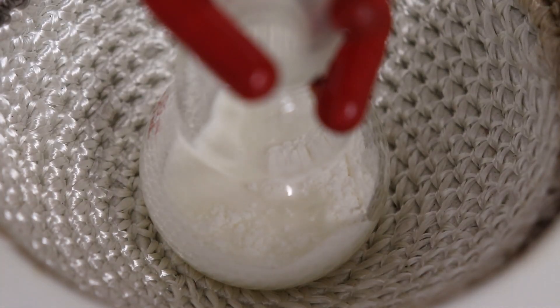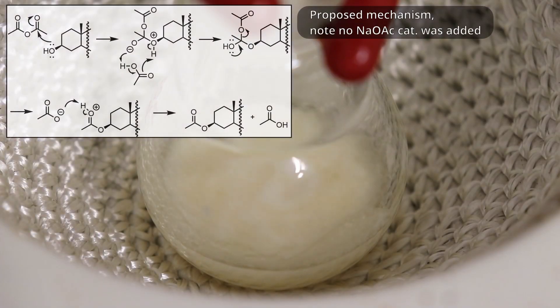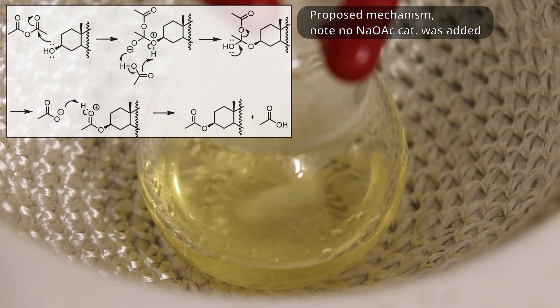At first, the mixture was unable to be stirred, but as it heated up, more cholesterol dissolved, freeing up the stir bar. And once the mixture got up to reflux temperature, it formed a clear yellow melt.